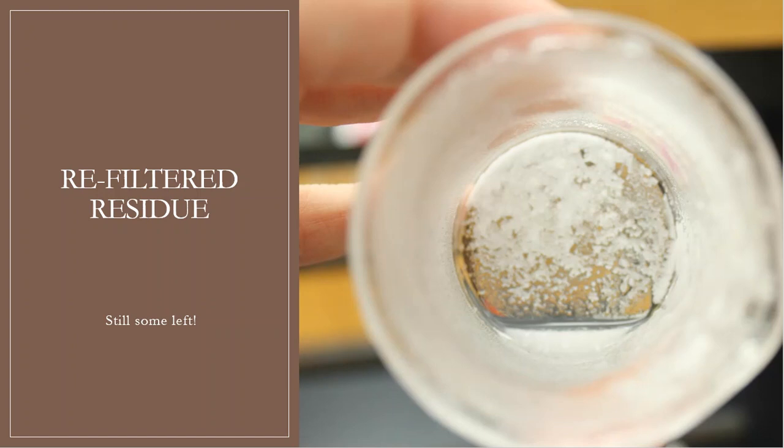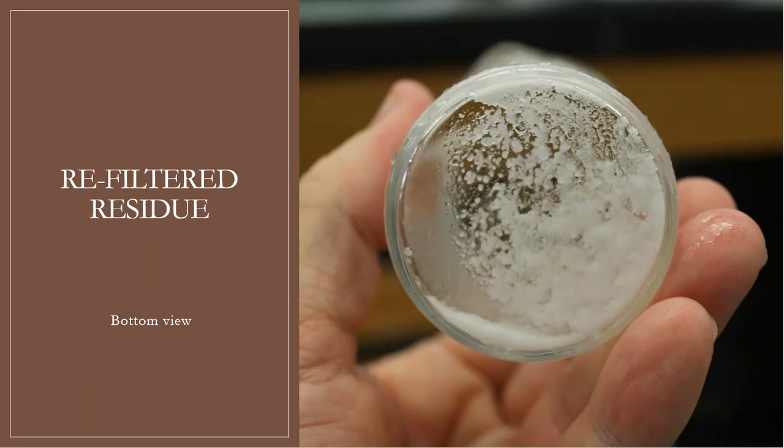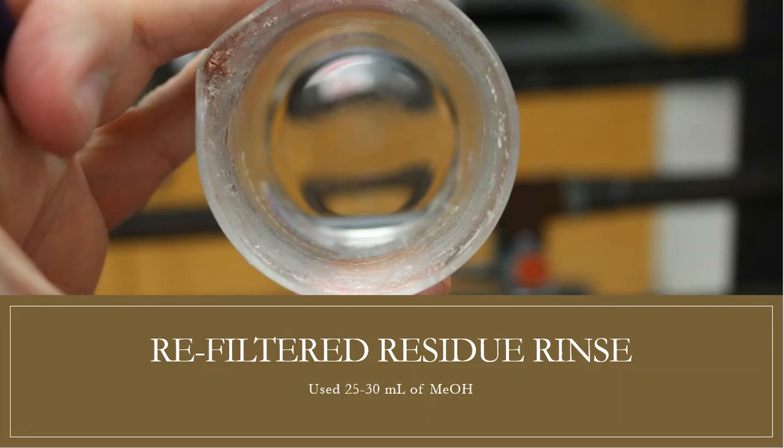So I take it, I dump it through, I still get a little bit of residue that's left over in that beaker. So of course, what do I need? Some more ice cold methanol. So this is the pour through first, and this is what's left over. That's from the top view, this is what's left over from the side view, and this is a view from the bottom. Okay, so I'm going to add ice cold methanol, again another 25 to 30 mils. I give it a good swirl, and then I give it a good dump into the Buchner funnel.